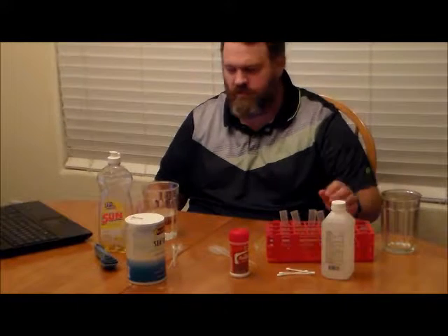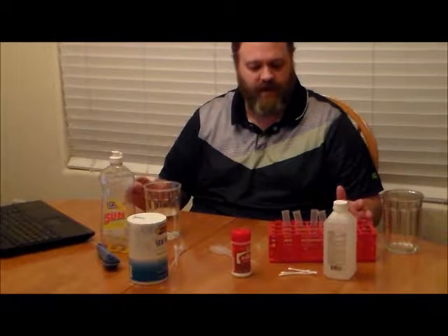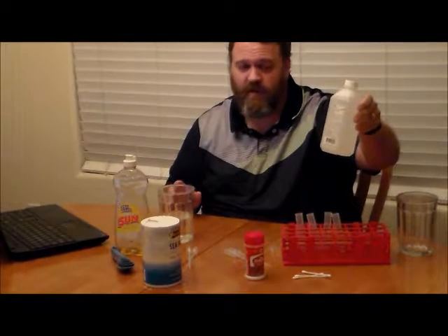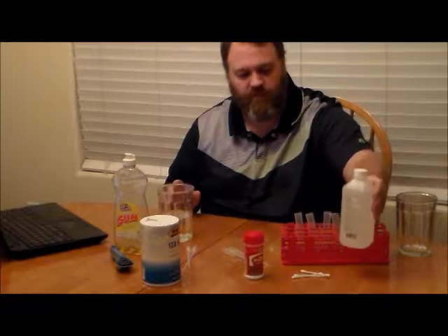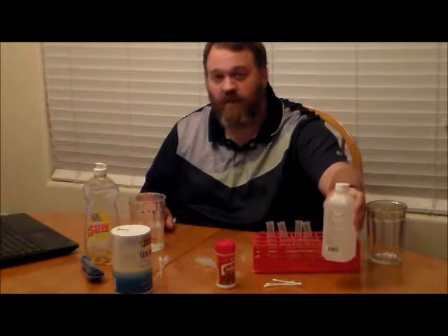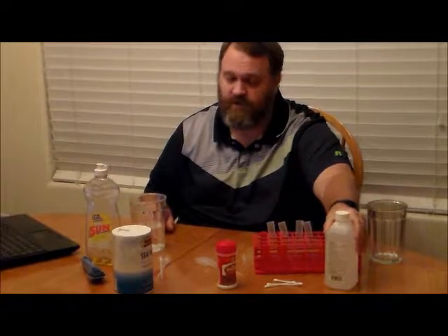All right, folks, before we begin the actual extraction experiment, we need to do a little bit of preparation in terms of mixing up some solutions and reagents. One of the things you need to do before you start the experiment is take your alcohol and put it in the freezer. It needs to sit in the freezer for about two hours. The alcohol won't actually freeze because its freezing point is much lower than 32 degrees, but it needs to be ice cold or freezer cold for this experiment to work.